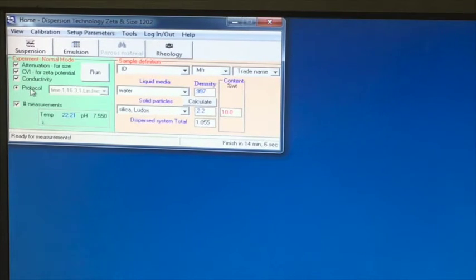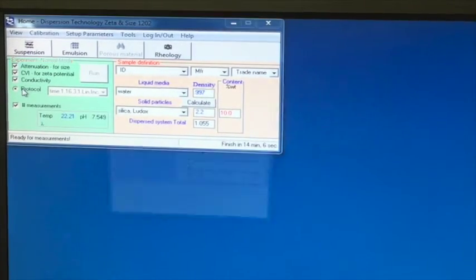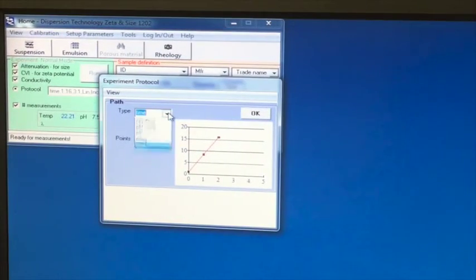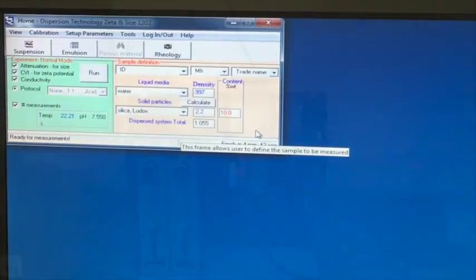The values of pH and temperature are measured every 2 seconds and displayed on this frame. You can also define various titrations using this form. There are 5 types of titrations: pH stat, pH ramp, milliliter titration, milliliter equivalence titration, and time titration. Demonstrations of these titrations will be done in a separate video.